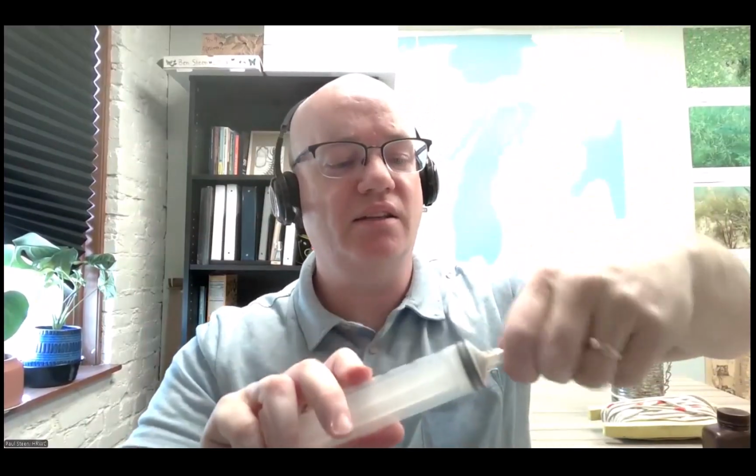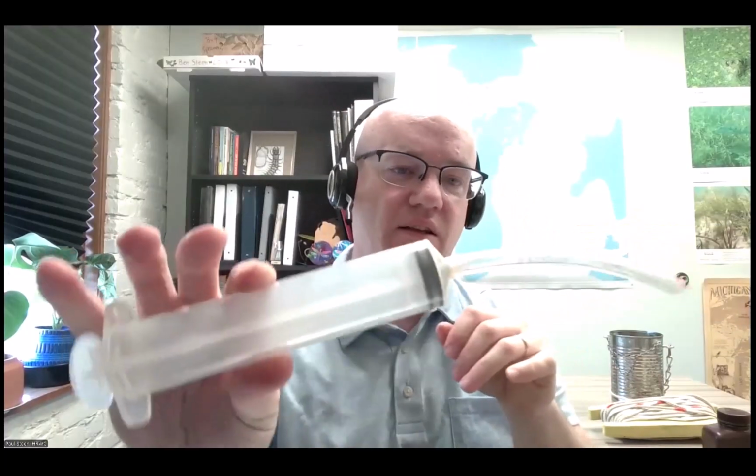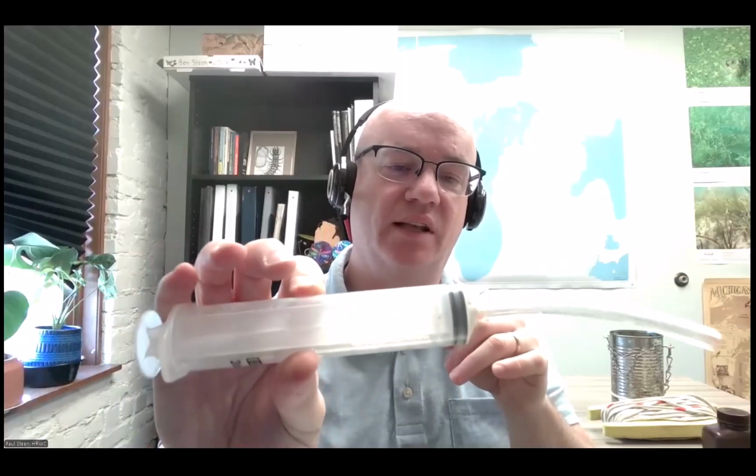You'll be asked to put the Tygon tubing onto the syringe. And the way you do that is you apply pressure and you twist. And it doesn't fit perfect, but it's pretty tight. You can get a nice tight seal on that if you just twist and apply pressure. And you'll see in the video later, that's how that works.